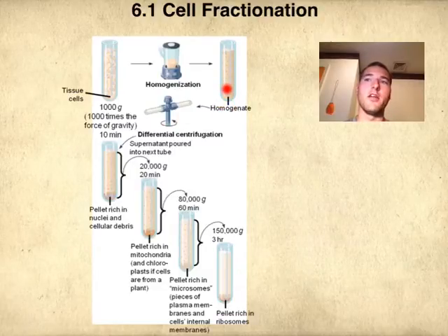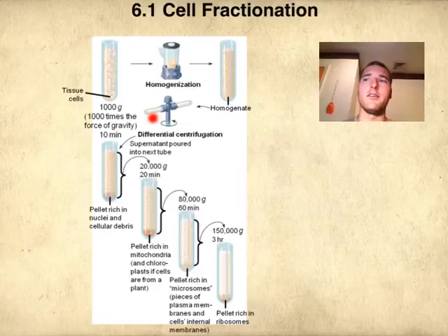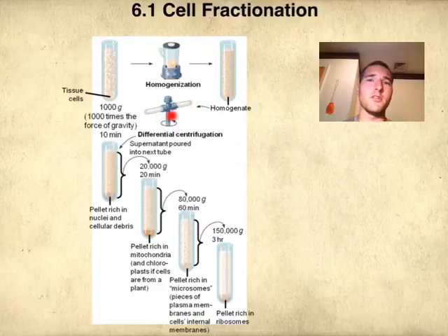So then you get what they call homogenate, and homogenate just means that all the parts are blended together. A centrifuge, and you guys have seen these, and you may have even used them in general biology class. The centrifuge basically spins really, really fast, and the centrifugal force from that spinning pushes particles to the ends of the tube as this spins around.